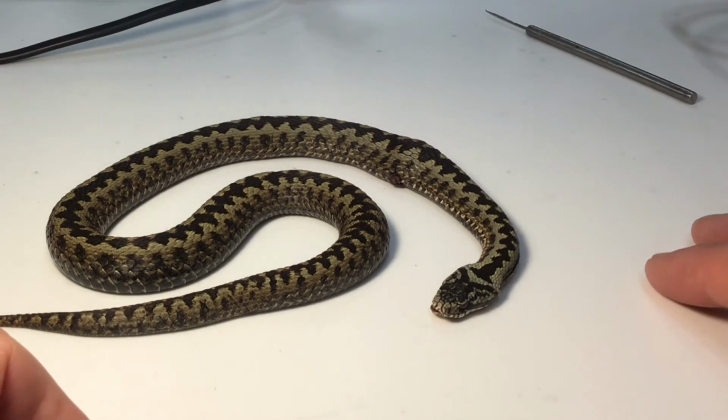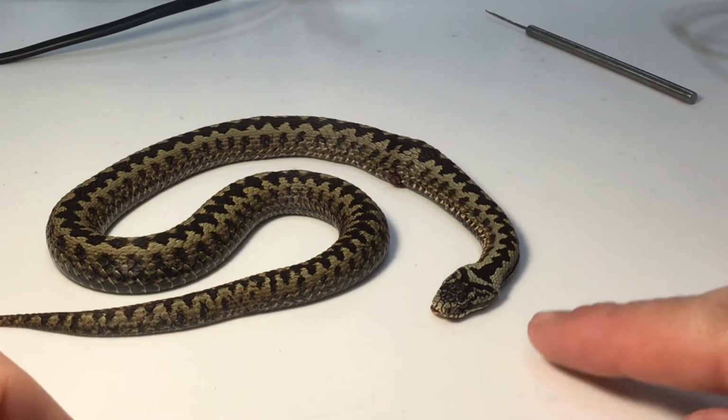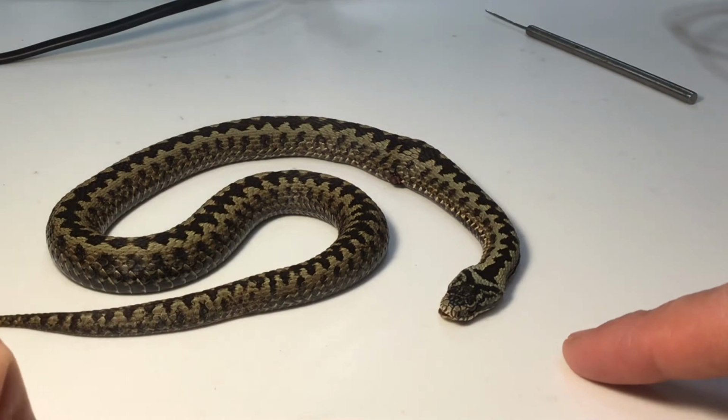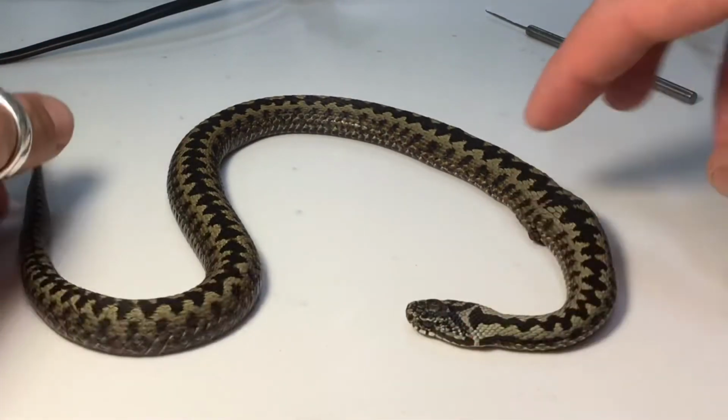I've measured this guy, and he's actually 50 centimetres long. The average length of adults of this species is about 60 centimetres, so they won't get a lot bigger. So people are surprised by how small it is. If I put my finger next to the head there, you can see how small. So they're actually not very long, but obviously they pack a punch.